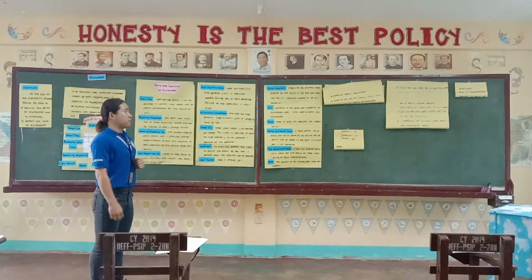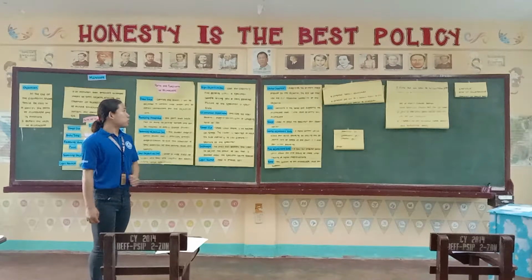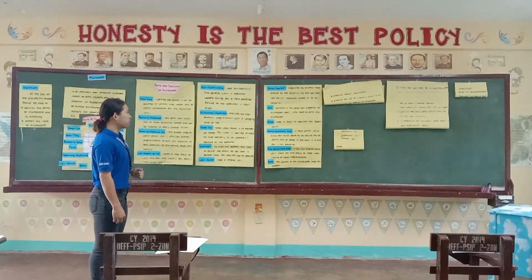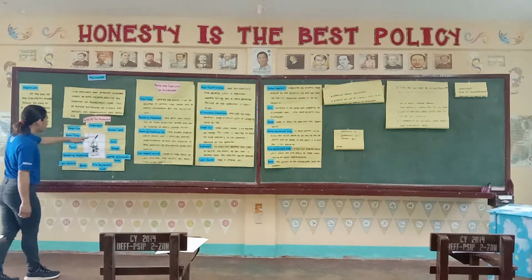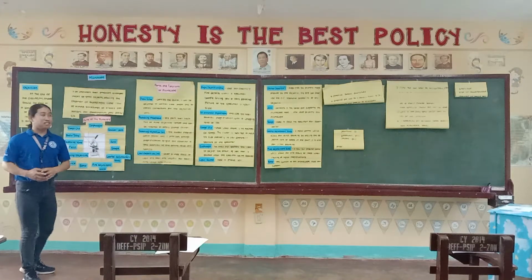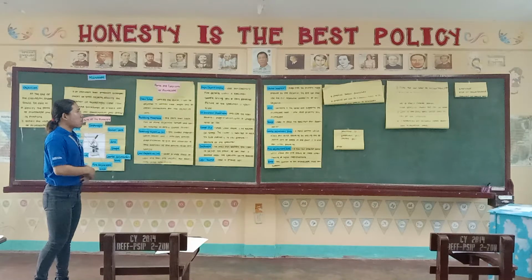So the ocular eyepiece magnifies the primary image produced by the objective. The eye can then use the full resolution capability of the objective. So over here, we have the ocular lens. The ocular lens is the one that primarily magnifies the image.